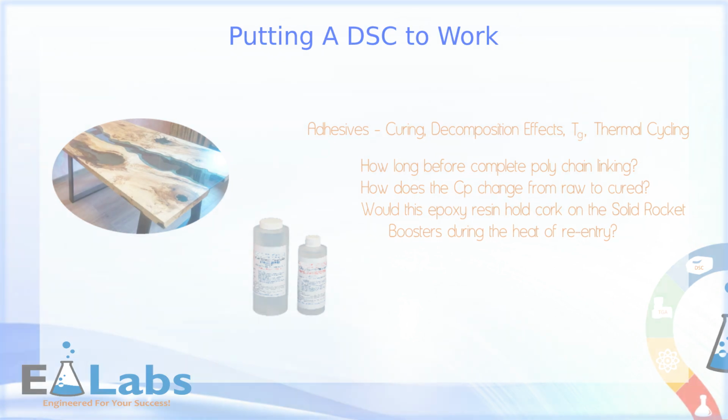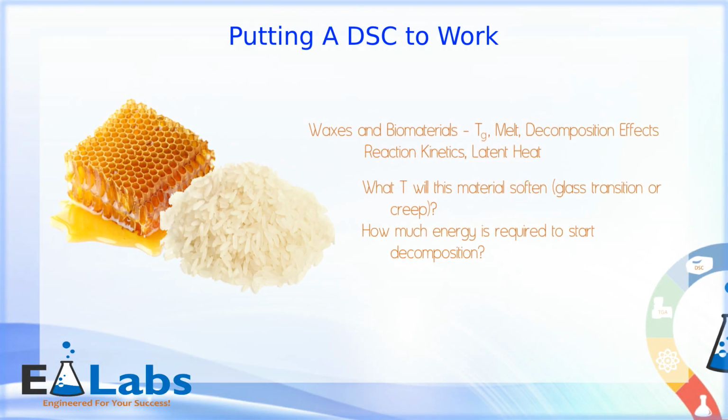Now let's keep our ideas rolling with biomaterials. Many researchers are using DSCs to test human and animal food. Do you want to know when the rice in your Rice Krispies will puff? How much energy does that puff require? Even a novel thermal insulating material was designed around wax encased in cork. The wax absorbs energy from the cork to undergo melt, thus reducing the temperature of the surrounding cork, if only for a moment, allowing the cork to absorb more thermal energy.